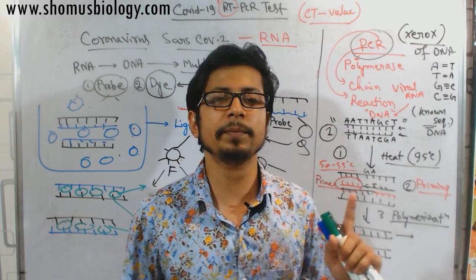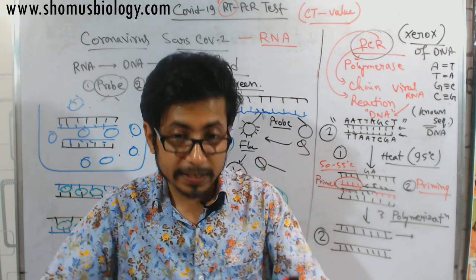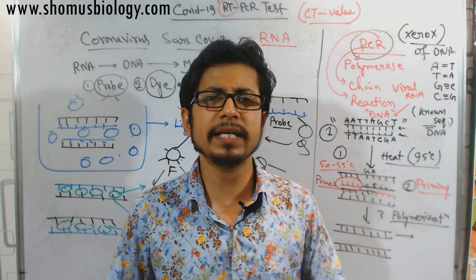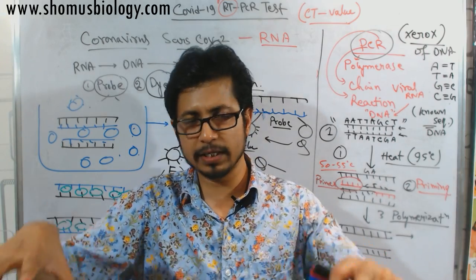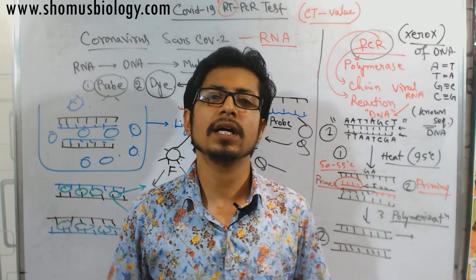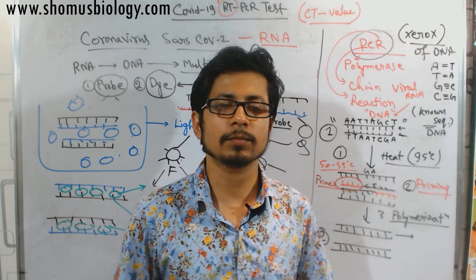But now RT-PCR can be done very rapidly, and in a single run we can run as many as 96 samples, and in some cases even more, in an RT-PCR machine. There are different wells and systems, so based on that we can run a lot of RT-PCR tests with these machines, with the thermocycler machine.